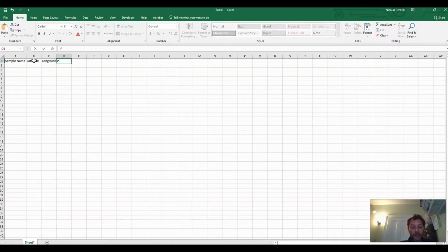Of course, one column for lead concentration, one for measurement error, and one column that will depend on your testable hypothesis, which is 1 or 2 columns for variables. These variables could be age of the structure, distance to a structure, or depths. Depending on what you've sampled, it could be whether or not your samples are in low lying elevation or high lying elevation. I will build it for my case, and in my case there will be 2 columns, one for the construction time and one for the age of the structure.